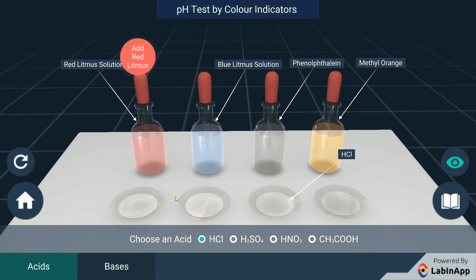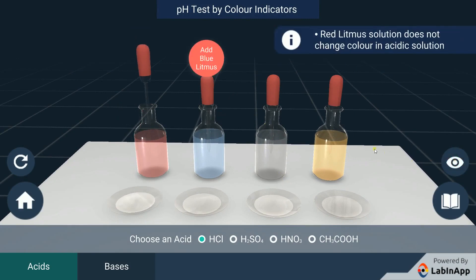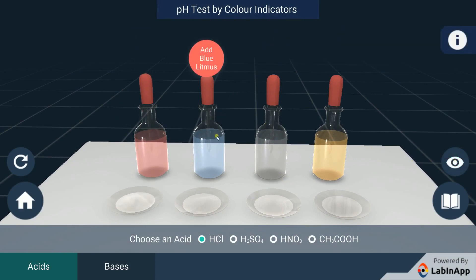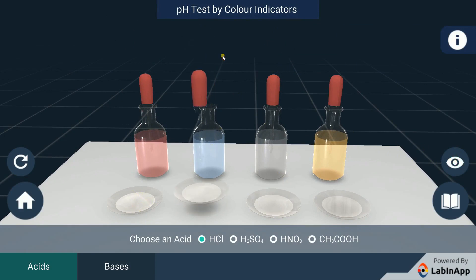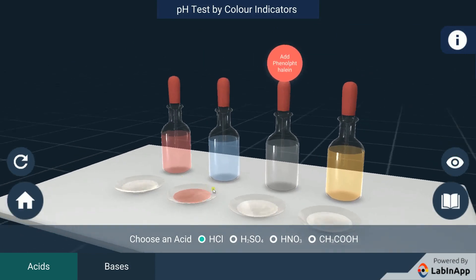We have taken an acid solution in four different watch glasses. Put red litmus solution indicator in the first watch glass and observe. We see that there is no color change of the acid. Add blue litmus solution indicator to the second watch glass and observe. We see the color of the acid changes to pink.